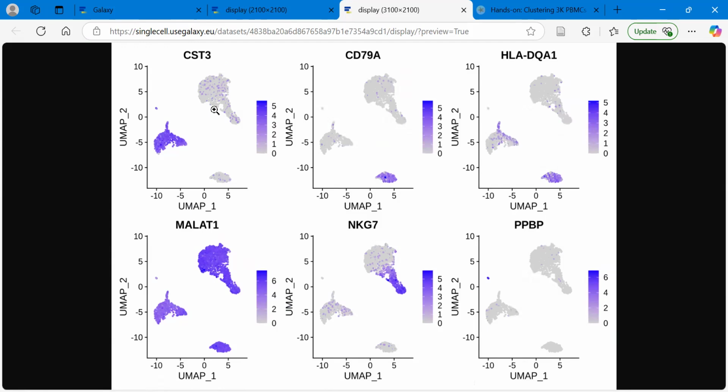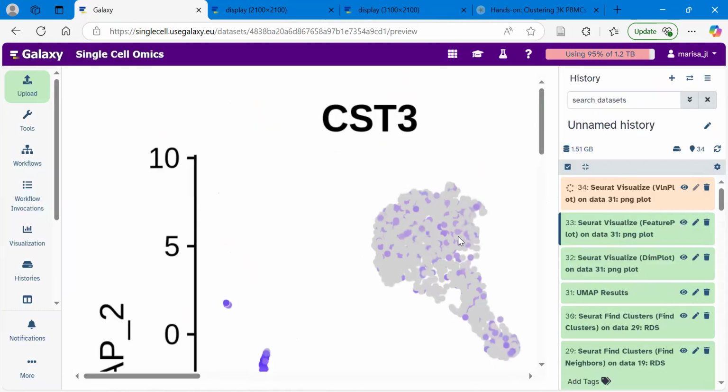So whereas previously when we looked at these genes on the PCA plot, they were associated with the axes, you can see now that they're no longer associated with these axes because these are now the UMAP axes, but we can see that there are groups of cells that have higher or lower expression of some of these genes. That makes sense to us because this UMAP plot and the clusters that we identified, we did that based on our PCA. So it makes sense that the genes that had a big influence on the PCA results would have some sort of connection with our clusters and our UMAP plot. And if we pop back here, this violin plot that we're just waiting for now is going to show these same PC genes.